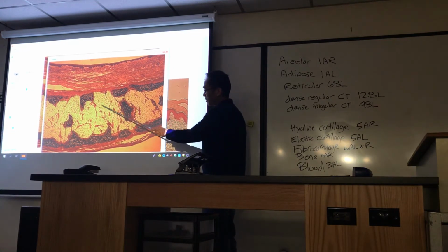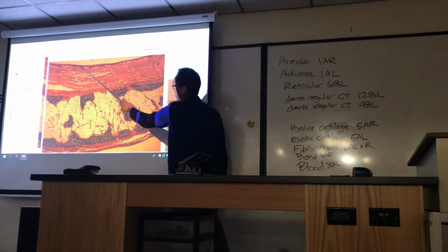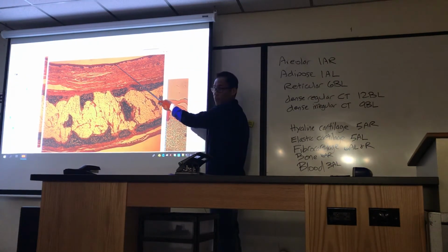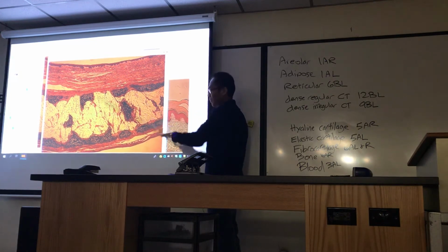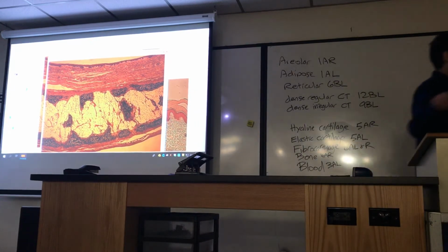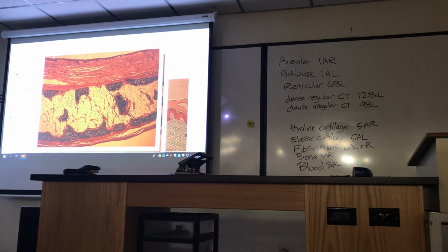What are the bubbly looking tissue? Adipose. Top, the surface, that's the epithelium. This is a stratified squamous epithelium up here. So I'll take pictures of all of them because they're all on your study list. So that's a Lomag. Stratified squamous epithelium. That is correct.